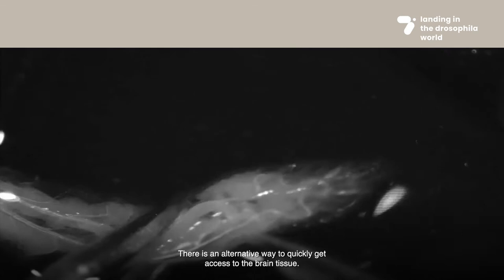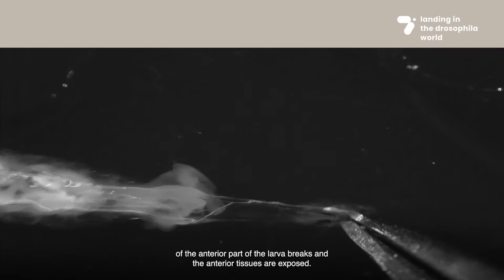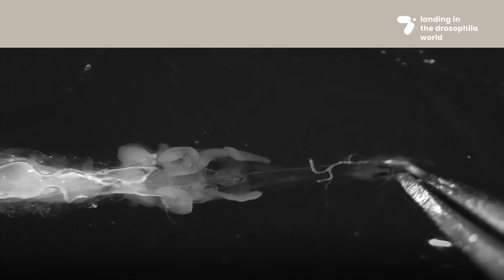There is an alternative way to quickly get access to the brain tissue. Grab the larvae at the center of the body with one tweezer; with the other tweezer, grab the hooks of the mouth and gently pull out until the body wall of the anterior part of the larva breaks and the anterior tissues are exposed.